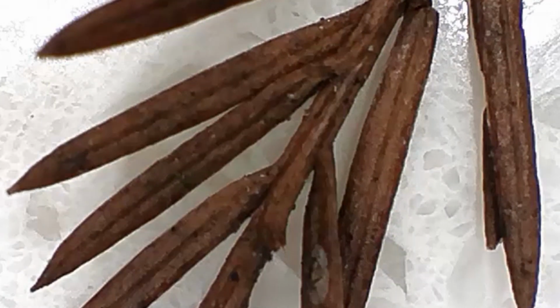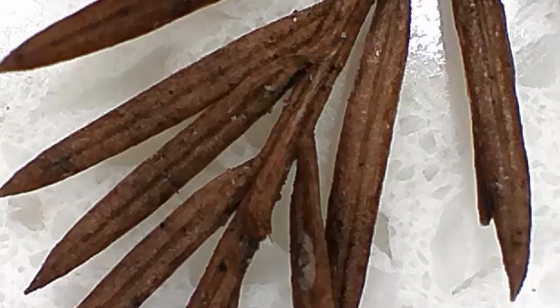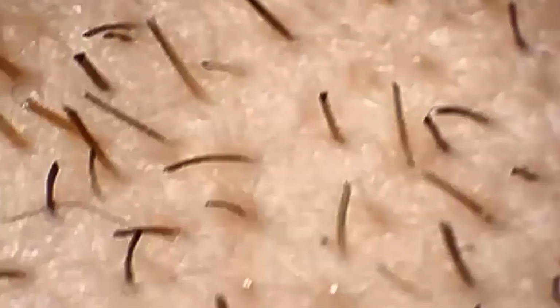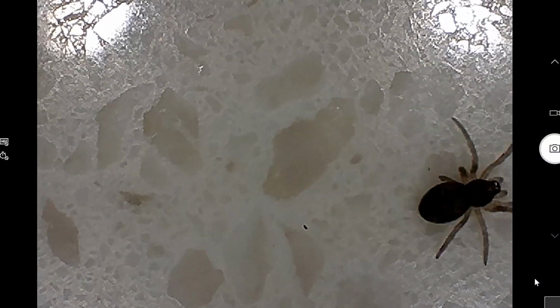Oh my. What do you see? It's like skin. All of this looks like skin. Can you see it? Ooh, see the big one. Okay, so ready? Watch. This is Henry's fabric. And then watch this. Look at that. Oh my, it's missing an arm.